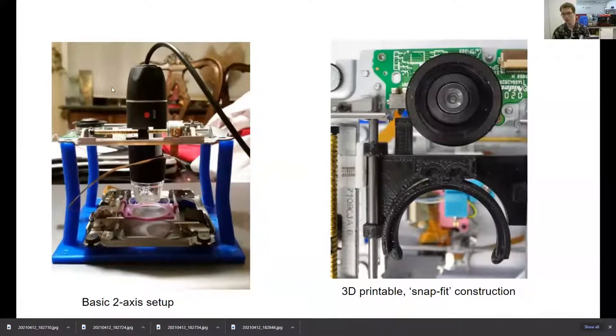Here's a $12 USB microscope — very cheap, available from Amazon or eBay, they're all pretty much the same. Here's a holder for a three-centimeter Petri dish, and you can see the component that holds the camera. This whole setup is really designed for 3D printing — I designed it from the get-go to be easy to print. There are no overhangs, everything is made out of simple shapes, and the whole construction is meant for a snap fit. I like hearing the satisfying click as you put parts together, and it saves on screws.